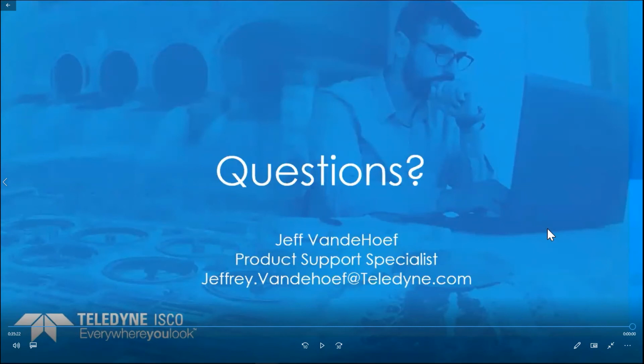I assume if nobody's touched it for a while, you probably don't know how to program it and everything like that. We have a tech support line here. You can give us a call, and we can step you through the programming of the samplers and answer any other questions that you have about that. But yeah, those are the main things: the power source, your suction line, and a strainer. I would assume you probably still have the bottles too, but that would be another thing to consider, is make sure you have a bottle.